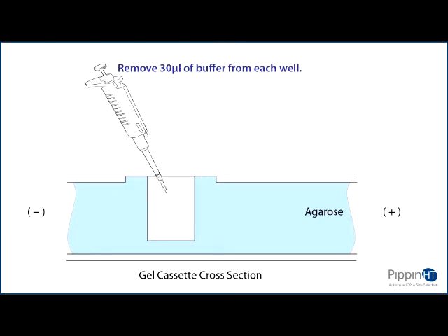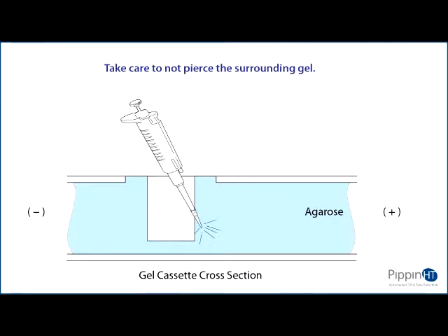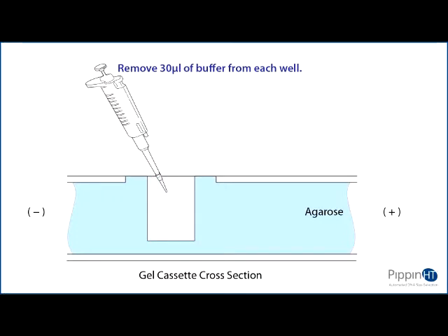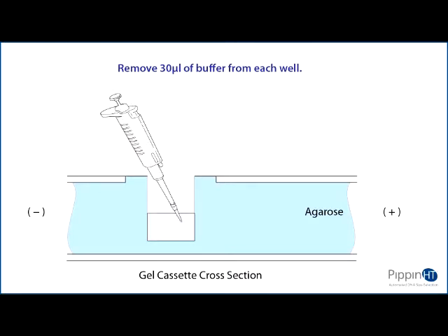Remove 30 microliters of buffer from the sample well. Take care not to pierce the agarose with the pipette tip. There is gel on all sides and bottom of the sample well. In addition, there is an agarose chimney surrounding the top of the sample well that protrudes up through the cassette cover. When removing buffer, some users find it useful to immerse the pipette tip just below the surface of the buffer and follow the liquid level down with the tip as the buffer is removed.